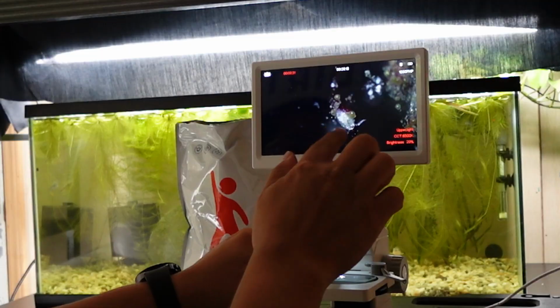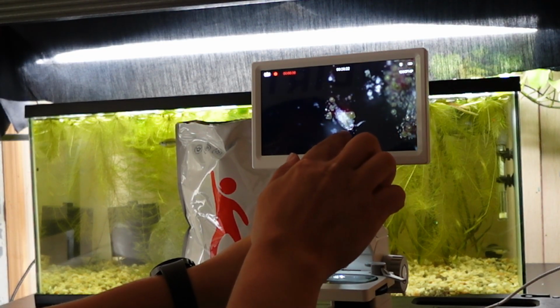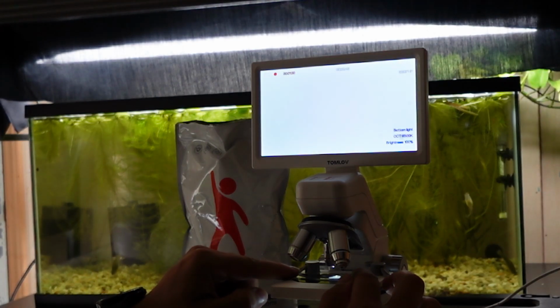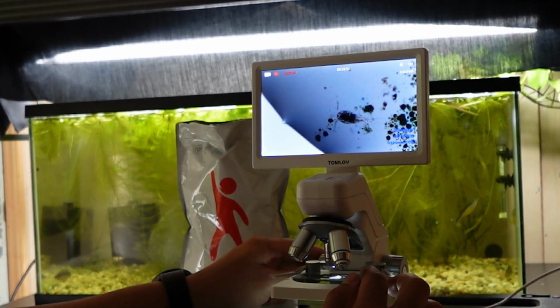Yeah, so here's our copepod. I think that's a copepod. Spirulina powder is all sprinkled around it, and you can see little things just going. He's just munching right now. Oh, you can see him digesting it now. This is insane. This is crazy. I did not think this would work as quickly, but he's attacking it. He must have been hungry. Whoo! All right, let's see what else we have. We're gonna turn the light around and see what else we can see. He's still munching.